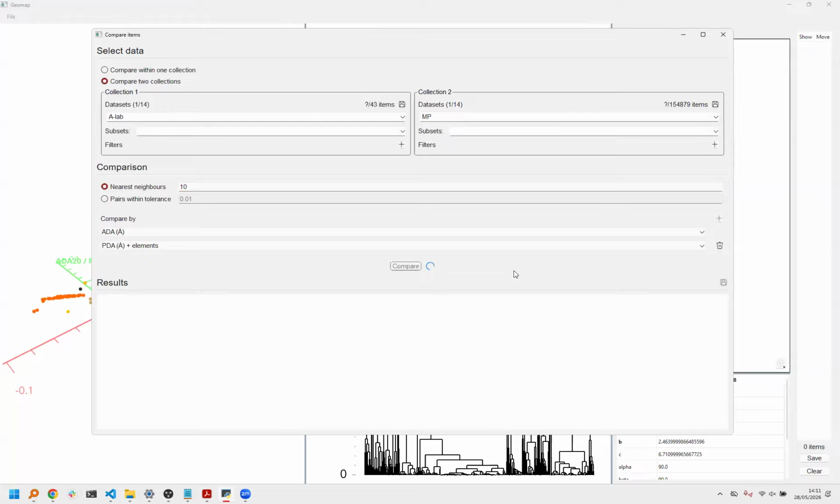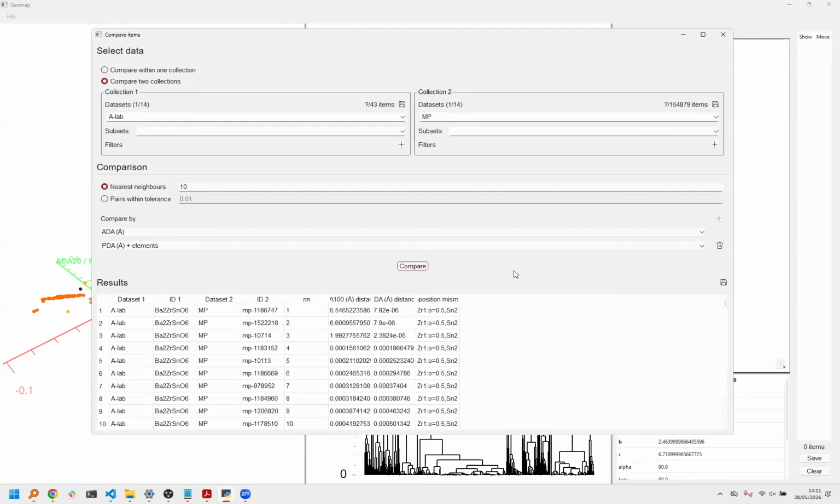And you could actually just do this by brute force. But if you use binary search, because it's just a big list of vectors, it's immediate, so it's already here. Scrolling through, this ALAB crystal, we immediately found an equivalent entry in Materials Project. I believe it predates ALAB.